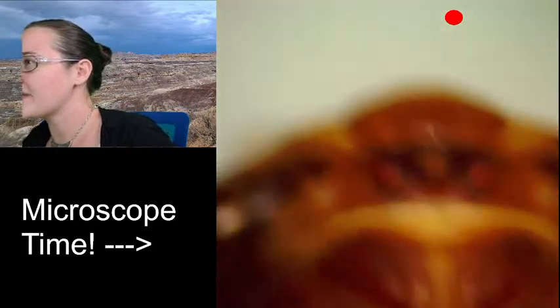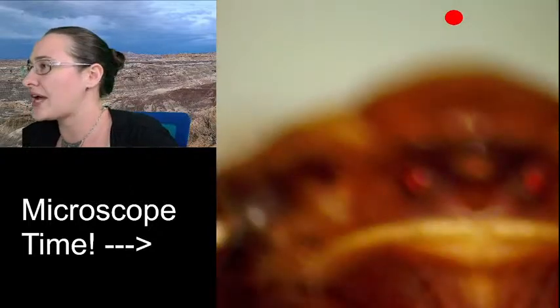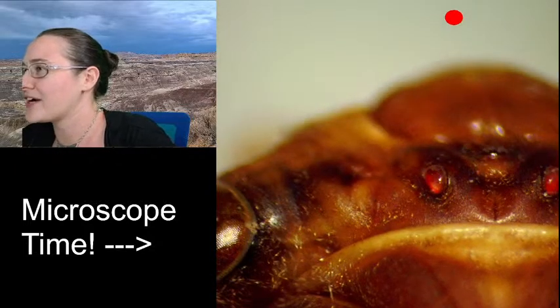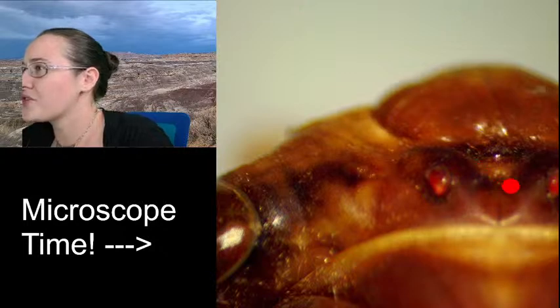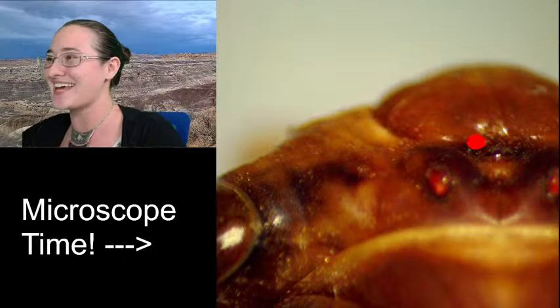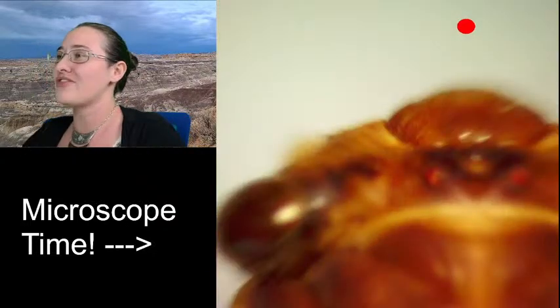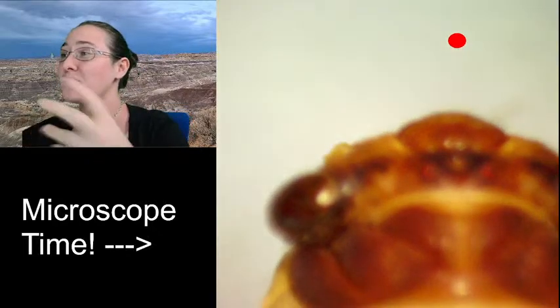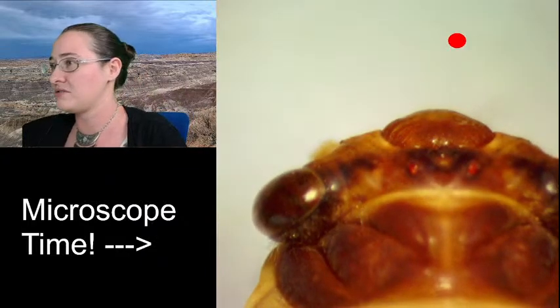Yeah, so I think that third ocelli is probably pointing forward on a hill, which is why we're not... Yeah, it's right about there. There's this little shiny spot right here. If you imagined that it exists, the thing is we're looking at it from a dorsal view. So the ocelli right there on the top is actually pointing forward rather than pointing up and to the left or up and to the right like the other two.